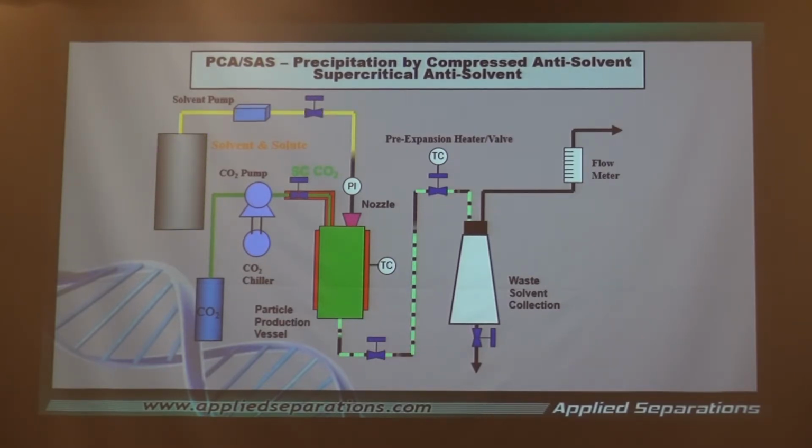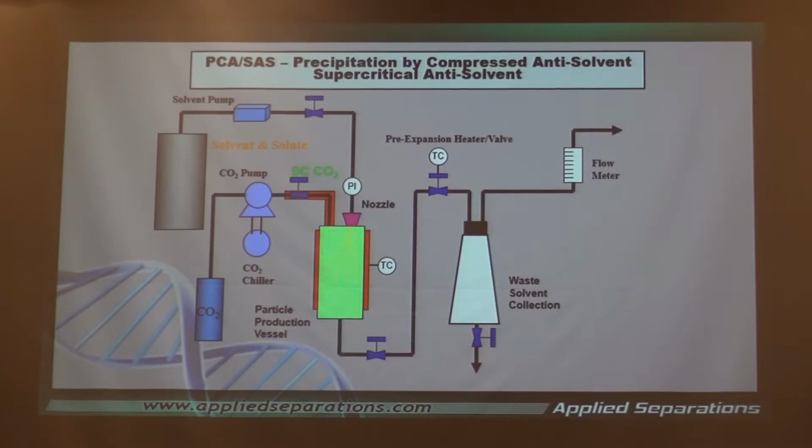And we spray this through a nozzle. And again, the CO2 is passing through. The solvent will dissolve into the CO2. It is carried away. There is not enough solvating power in the original solvent anymore. So you get a case where now you don't have enough solvating power and the precipitation will occur. Again, the amount of solvating power of the CO2 you can control by the density, that is by the pressure. The tunability factor comes in again.